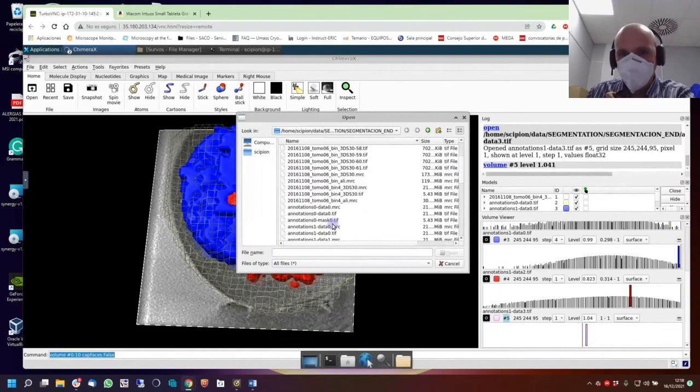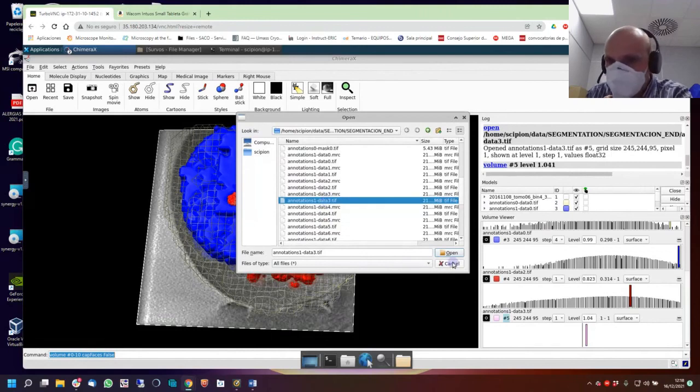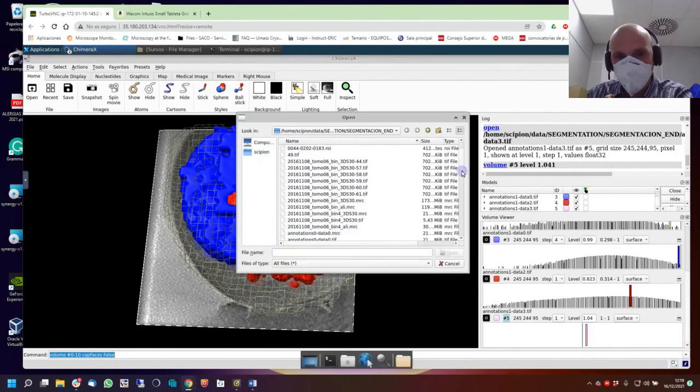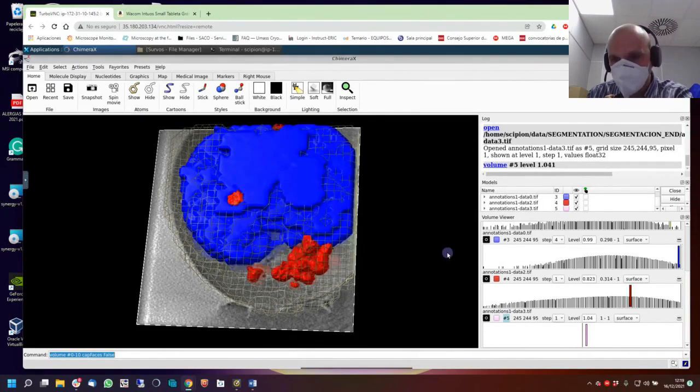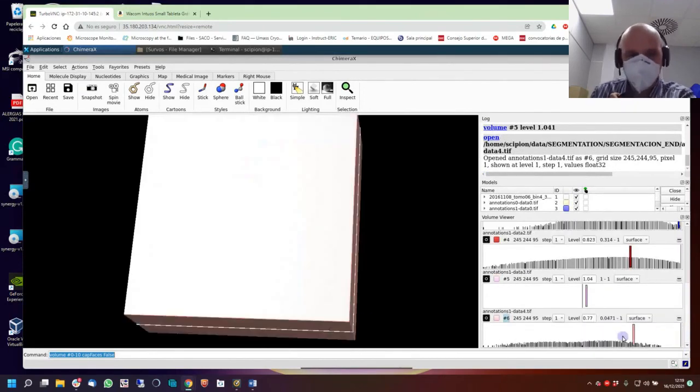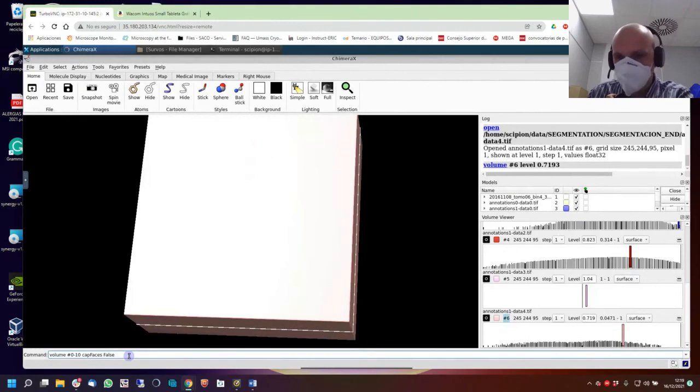So let's go for the 4. 3, sorry. So it is click, click, click, click, click, cancel. The last one is 3, so the next one is open. It will be the 4. The data 4, open. Go down. Here we have this problem. Don't forget to click here. Now we have something here.